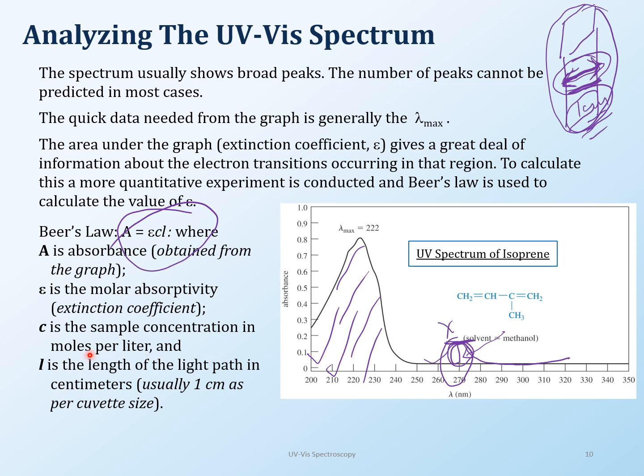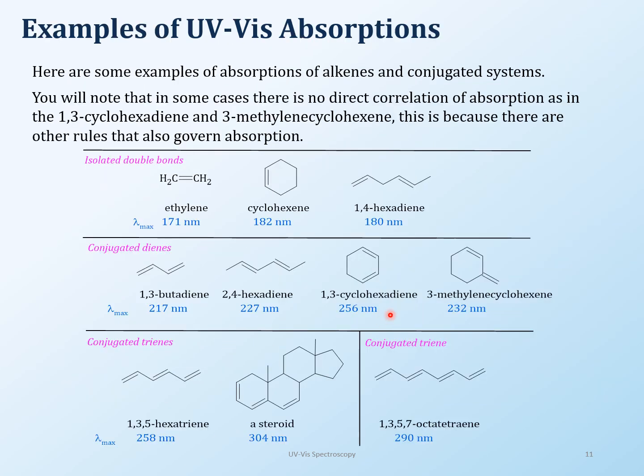The concentration that I was explaining to you has to do with also the energy, okay? So you want to keep that distance constant. The L, sorry, not the concentration, the L. The concentration also has to be kept specific, because if you change the concentration, you change how much energy is being given, okay? So, I mean, it's a very specific kind of technique.